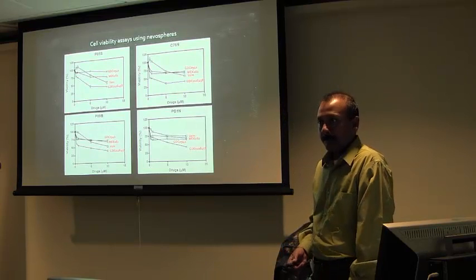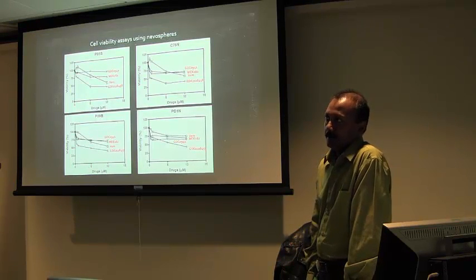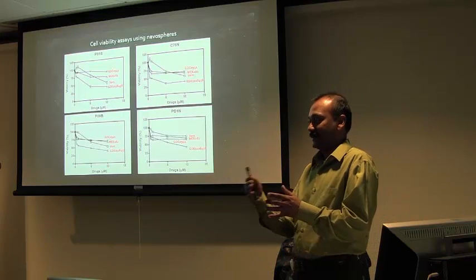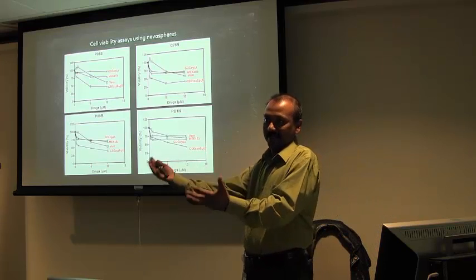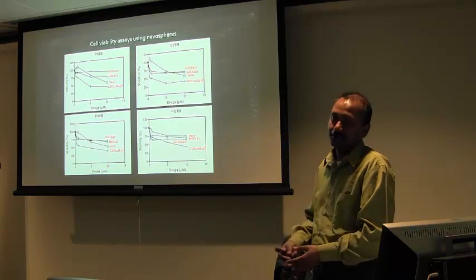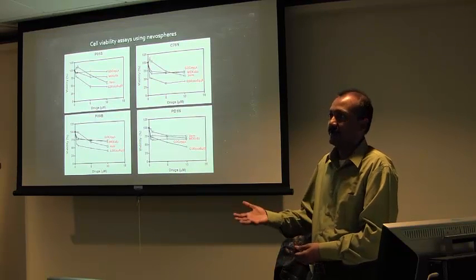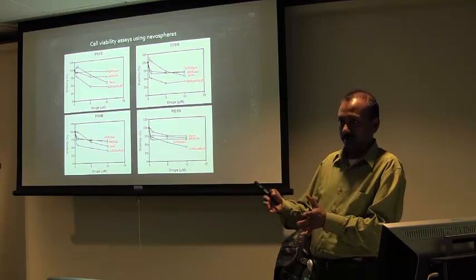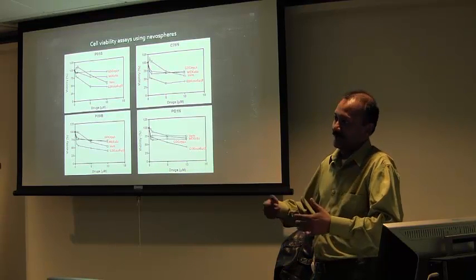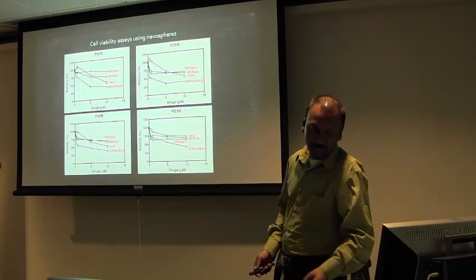What's the time frame for that? 2 weeks at least. Because we need to first make the cells survive, then expand, and then go into the spheroid, then treat. So at least 2 weeks. I would guess that the more aggressive the cancer is, the shorter the time frame will become. Since these are not aggressively dividing cells, the time frame is longer here.